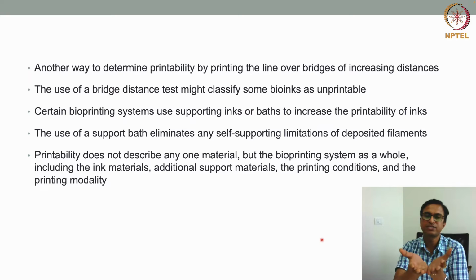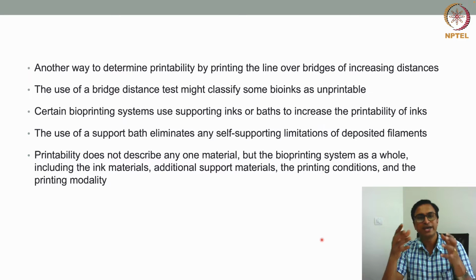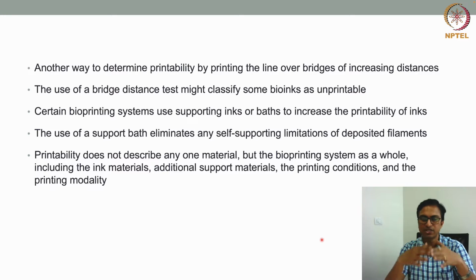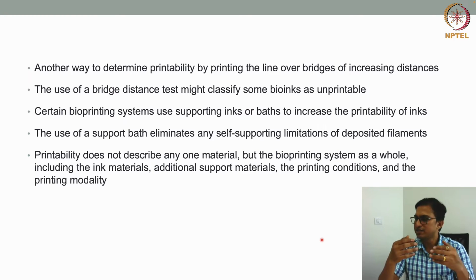So they are providing support to the printed structure, and using that support bath can improve the printability of your bioink, because the bioink having the support is no longer getting deformed, sagged, or widened.